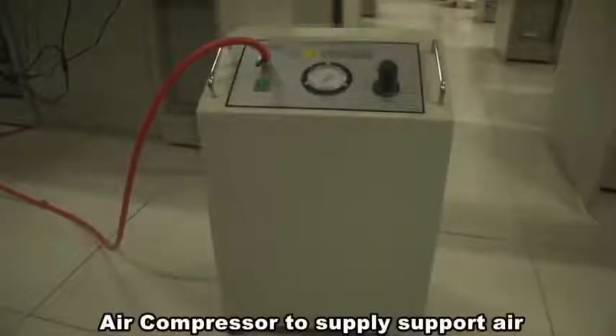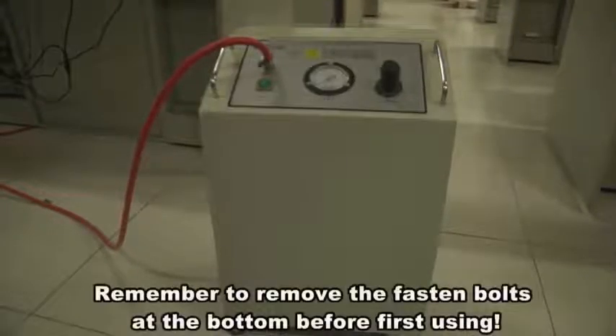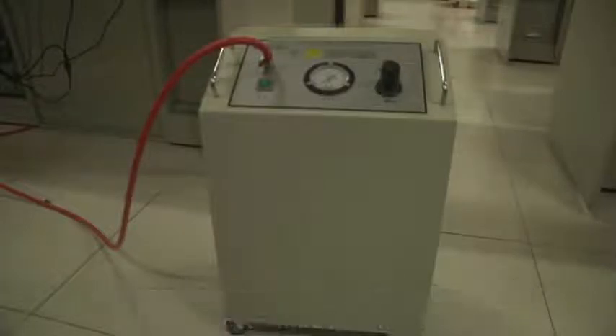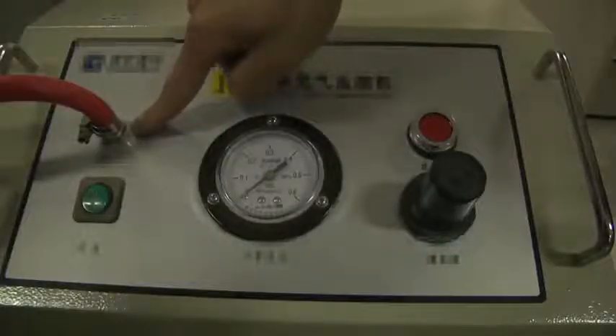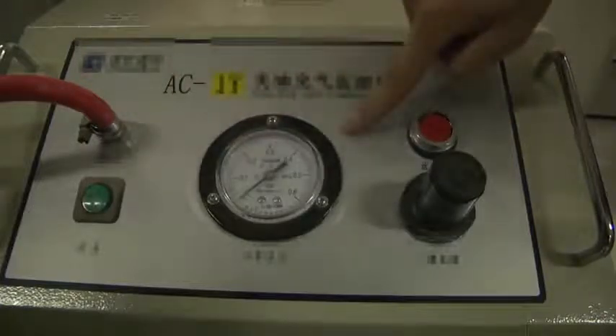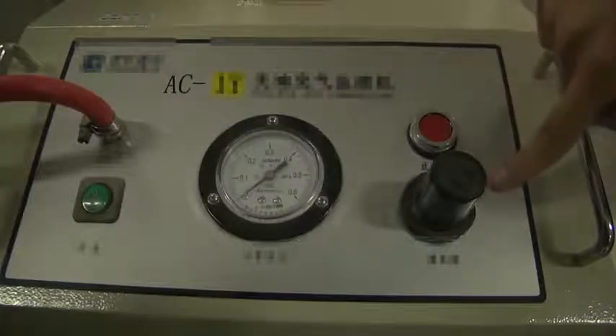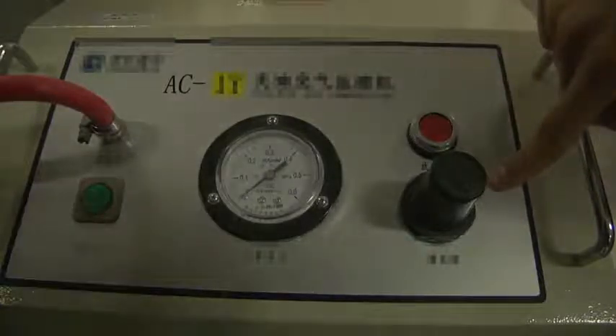This is the air compressor that provides air after unpackaging. Please make sure to remove the two screws at the bottom. The components include: air outlet, power switch, dashboard, release valve, and regulator.